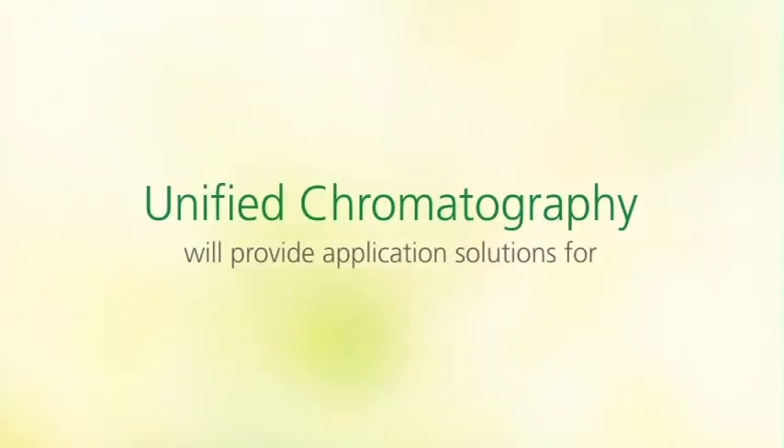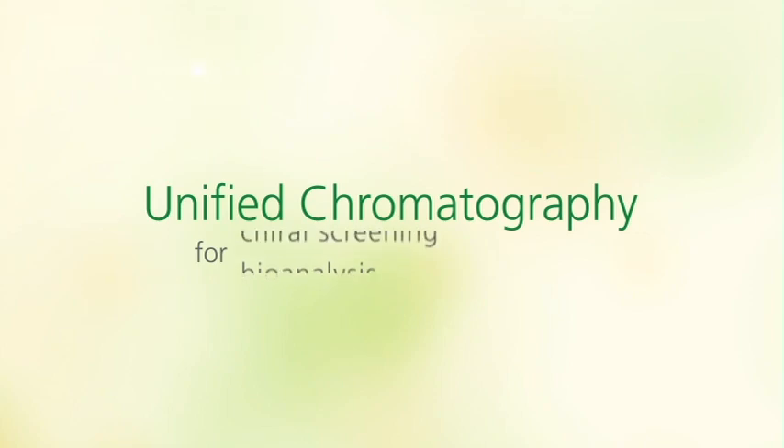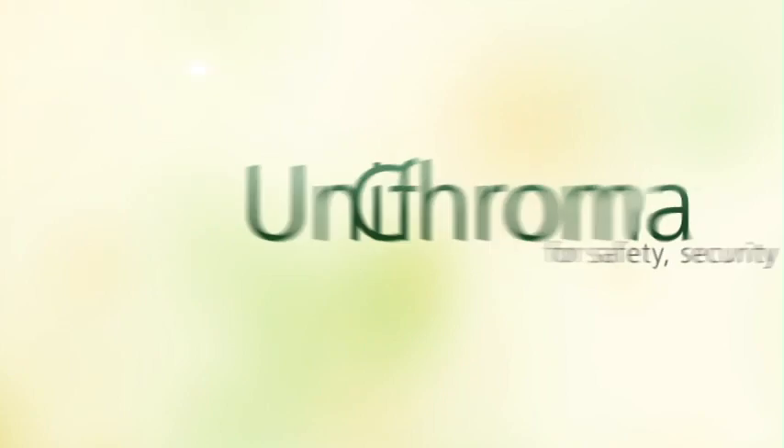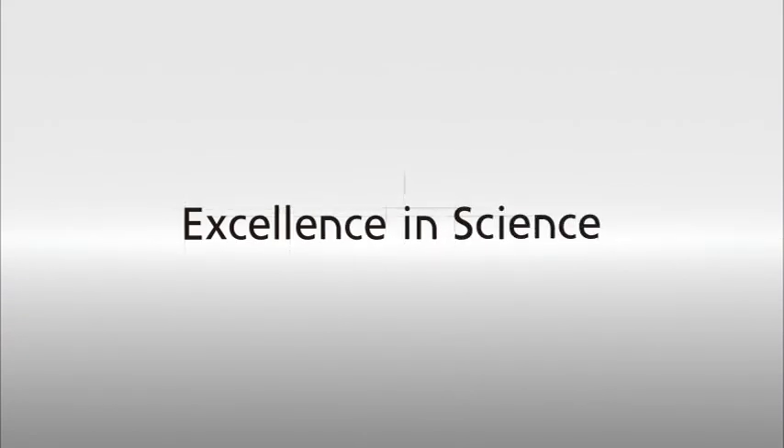What can unified chromatography result for you? The Shimadzu Nexera Uc system — leading-edge analytical technology for applications that enhance the safety, security, and health of people around the world. Excellence in science. Shimadzu.